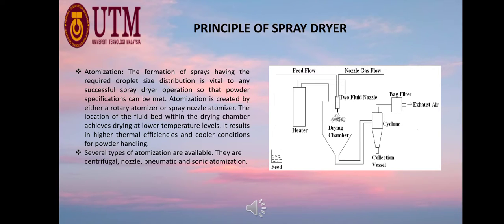The nozzle atomization process is actually the second most common form of atomization, which is also known as hydraulic pressure nozzle atomization. Here, the liquid is pressurized by a pump and forced through an orifice to break the liquid into fine droplets.